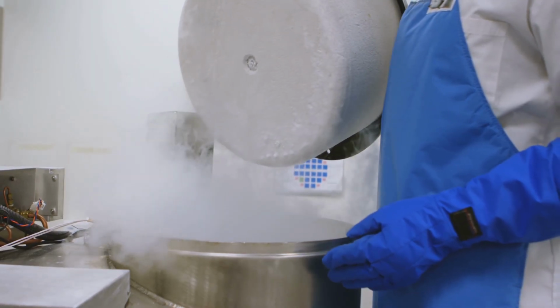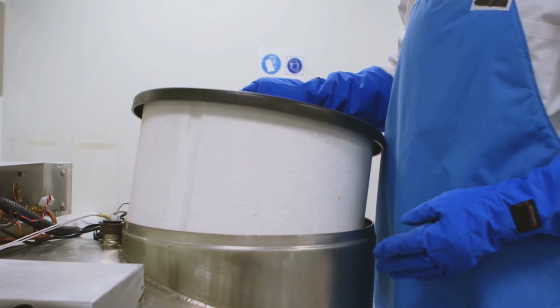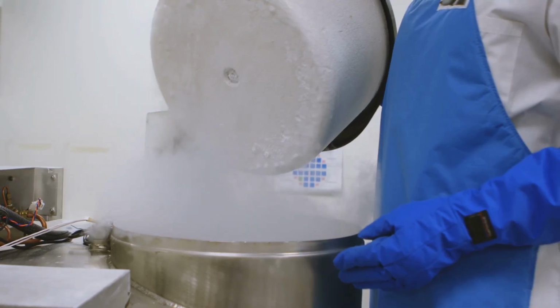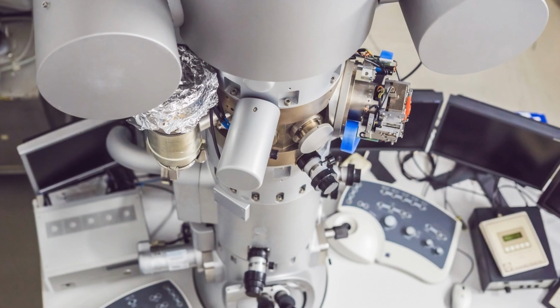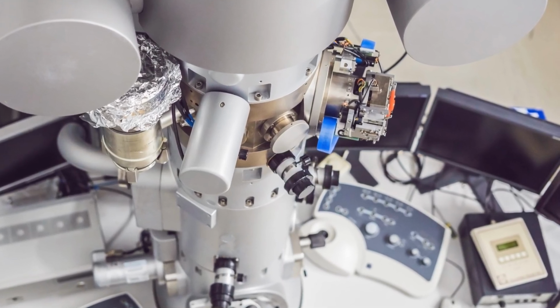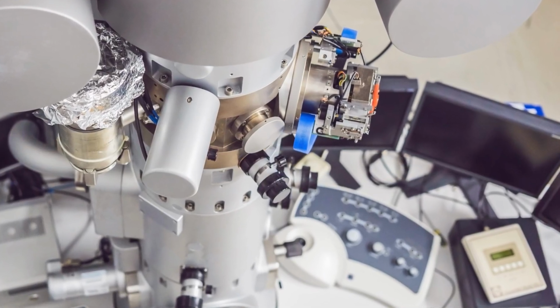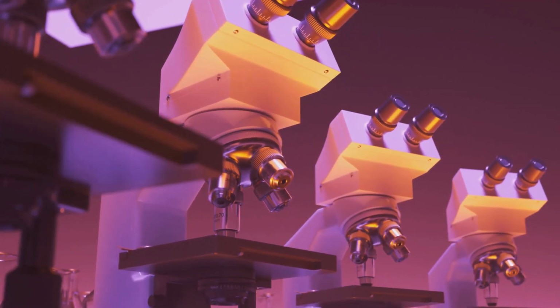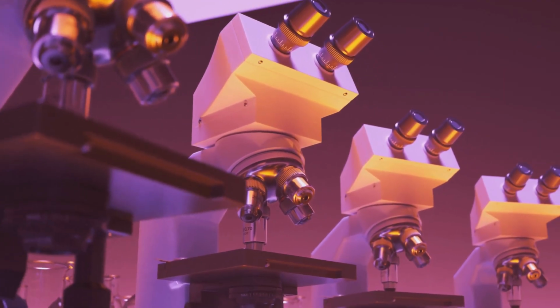Instead of using harsh chemicals and embedding samples in resin, cryo-EM involves flash freezing the biological sample in a thin layer of ice. This freezing happens so fast that ice crystals don't have time to form, preserving the sample in a near-native state. The TEM is then used to take thousands of pictures of the frozen molecules from different angles. A powerful computer then combines all these two-dimensional images to reconstruct a highly detailed three-dimensional model. This technique has become so important that its developers were awarded the Nobel Prize in Chemistry in 2017.